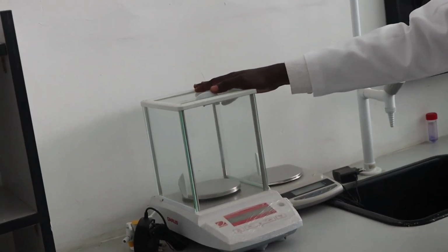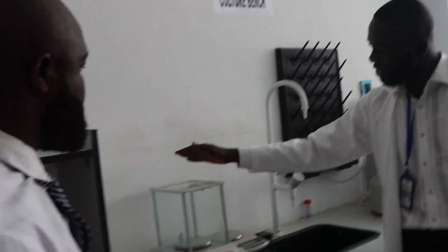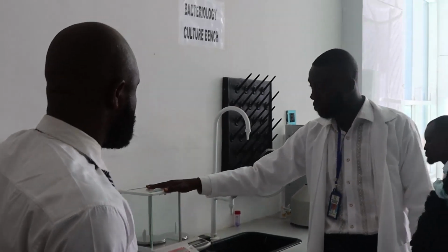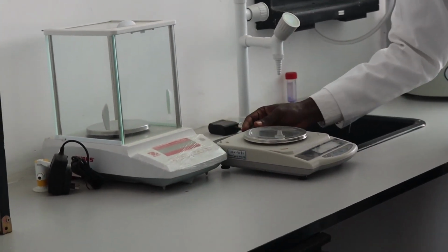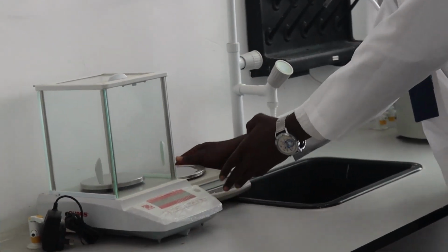We measure out certain compounds that we formulate and use at work. As you can see here, we can use this to measure out salt, what is known as sodium chloride. We also have another type, so there are two major types. The major difference is that this one uses battery, while this one uses electricity, but they are both measuring the same.